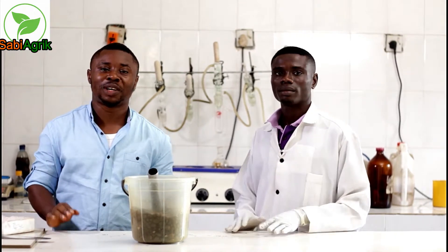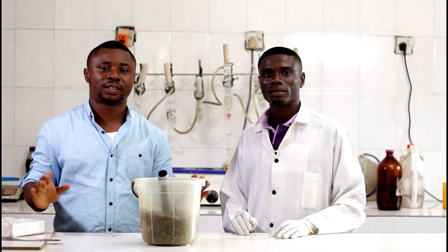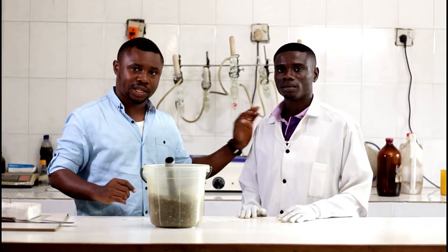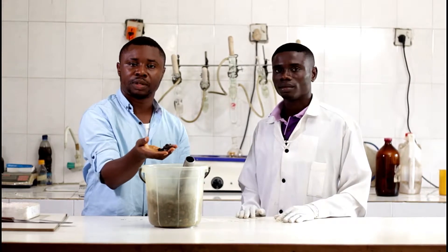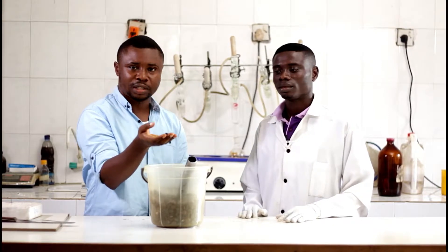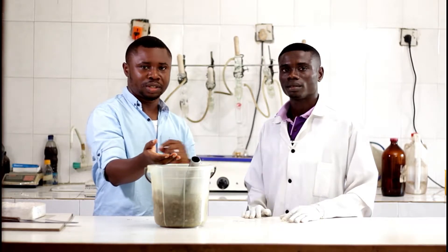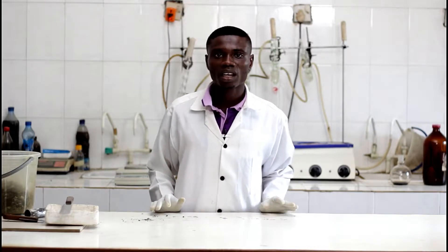Hey guys, we are in the Quality Control Lab section of Agro-Ideas International Company. Today I have an instructor, his name is Mr. Ididion Jack, and we have some samples of palm kernels. We're checking this for moisture and some other parameters, about four parameters. I'll leave us to our instructor to teach us.